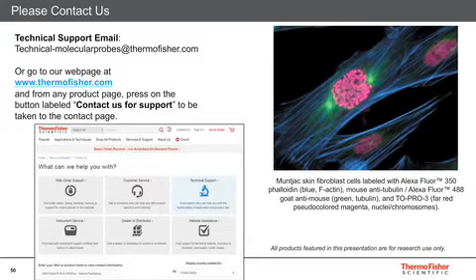Great, thank you. For our next question we have: I've never heard of charge-based background binding, like when you talked about the signal enhancer solution. Do all dyes have this issue?